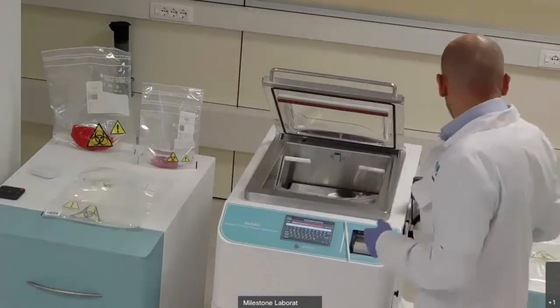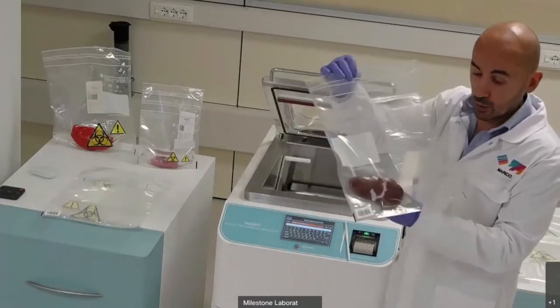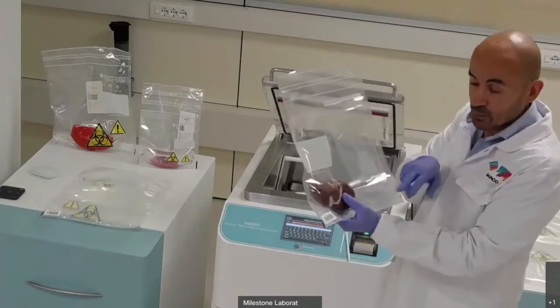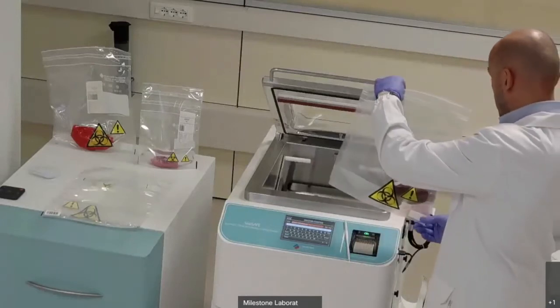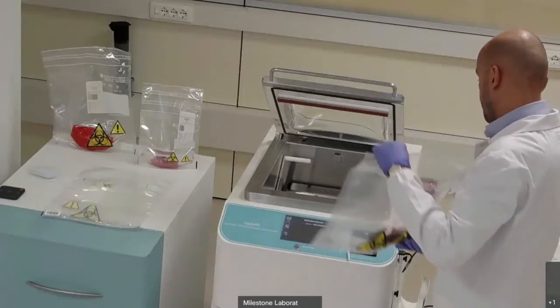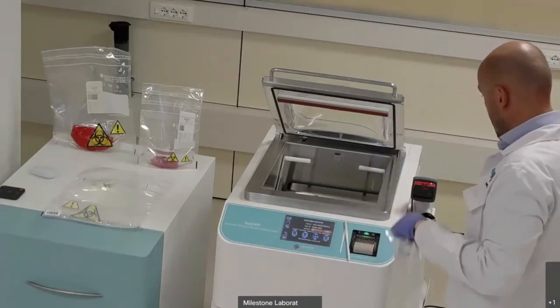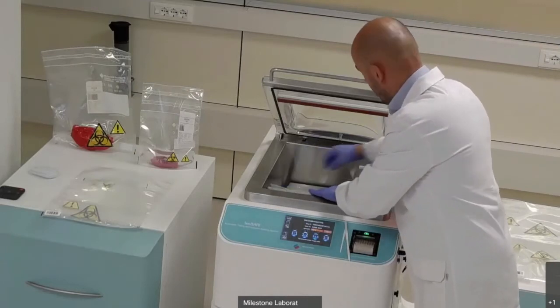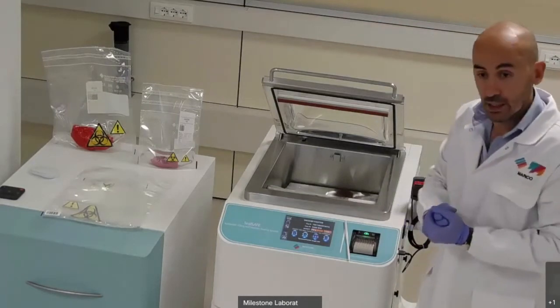Also in this case, I have a sample already ready in the cavity, and in order to start the procedure, I just need to scan the identification code of the bag, the identification of the patient, and place it in the cavity. I have these magnets which add further stability to the bag.